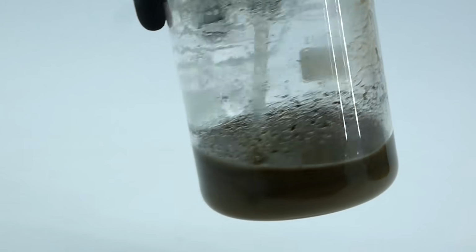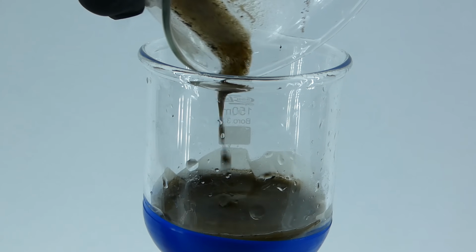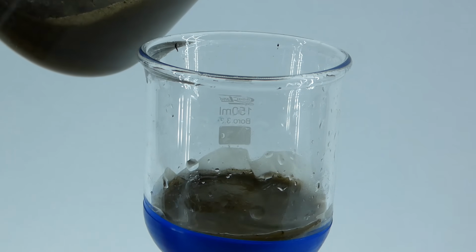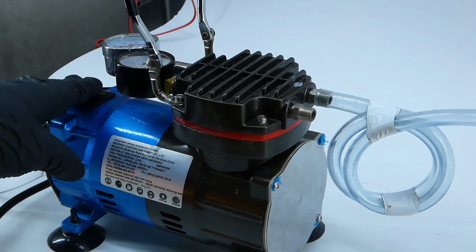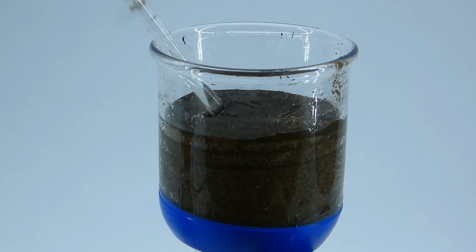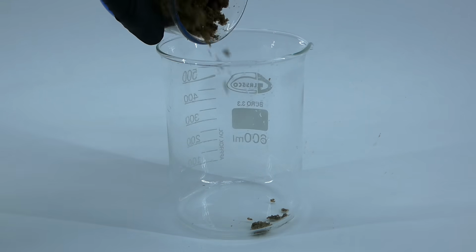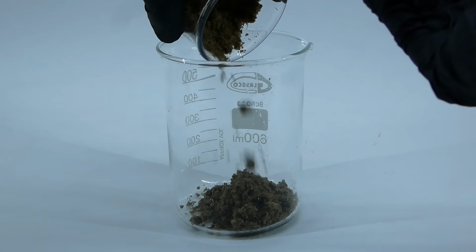I then wanted to vacuum filter it to get rid of the last soluble impurities, but my vacuum pump mysteriously broke, and that was very bad, but my dad came to fix it, and now it runs even better than before, so thanks Dad. Anyway, after the filtration was done, I transferred all of the sand into a beaker, and now it was time to chemically remove more of the impurities.